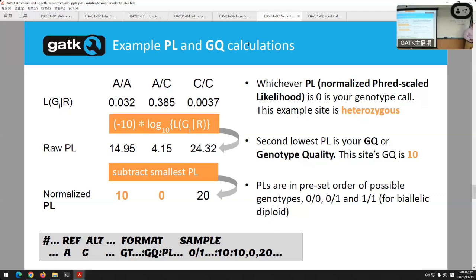If you're looking at, is it a homozygous reference or not? Q30, Q40 is fine. So it really depends. What most people do is they set a cutoff around Q40. That's still pretty good. But again, for most of the sites, most of the genotypes will be Q99. Good question. Other questions?